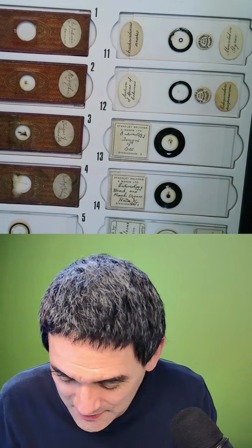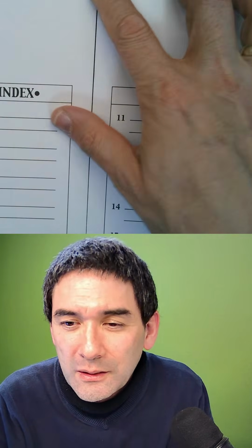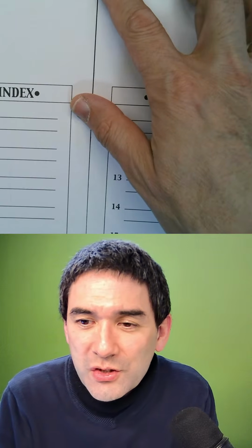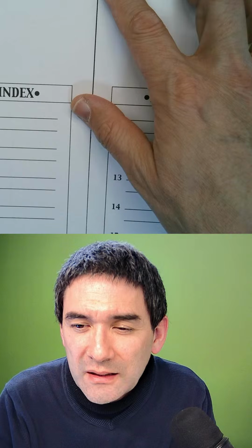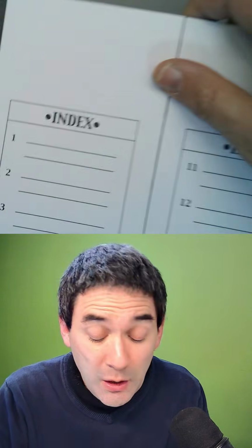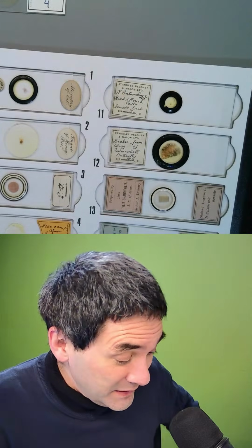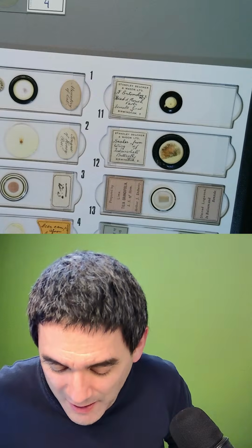So let's have another look at a few others. While listening to the stream, I'm also looking at the edge of a moss leaf. It's only one cell layer thick. It has little teeth like a nettle emerging. Honestly, that's one of the interesting things generally, that patterns in nature simply seem to appear, right?